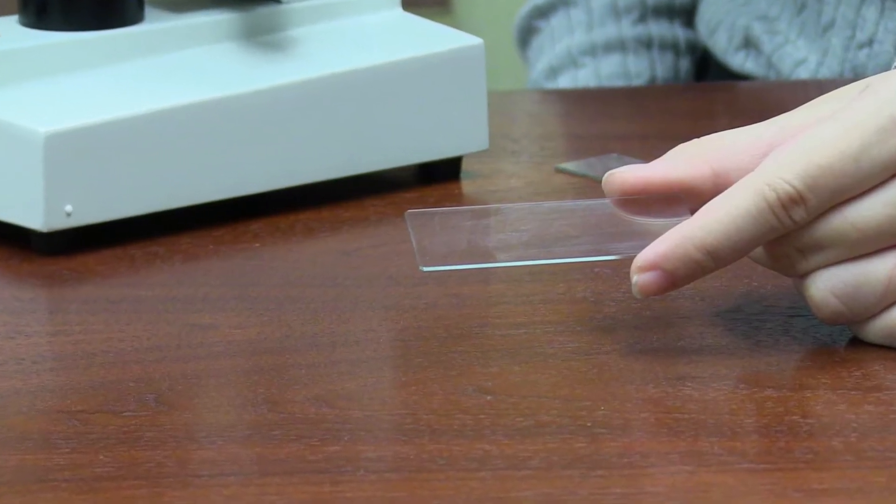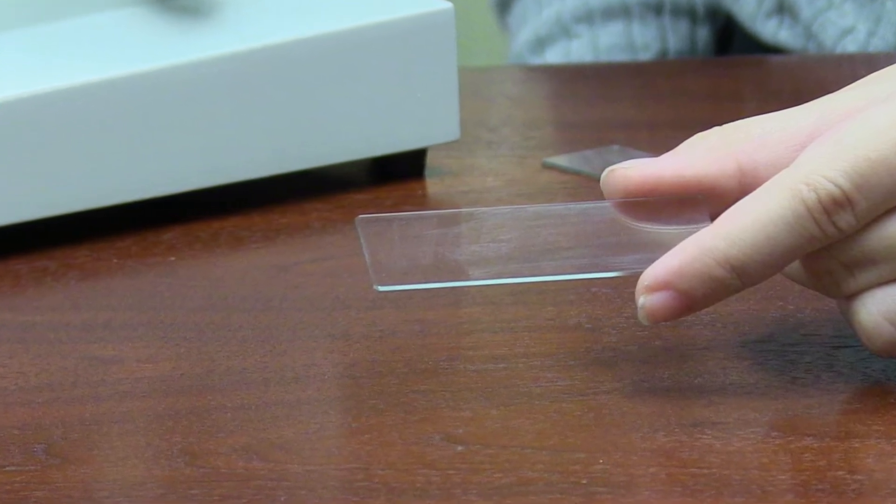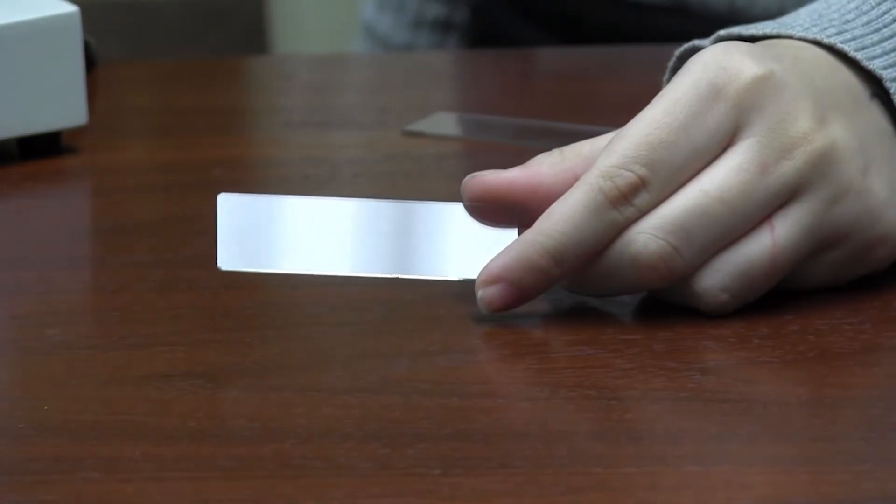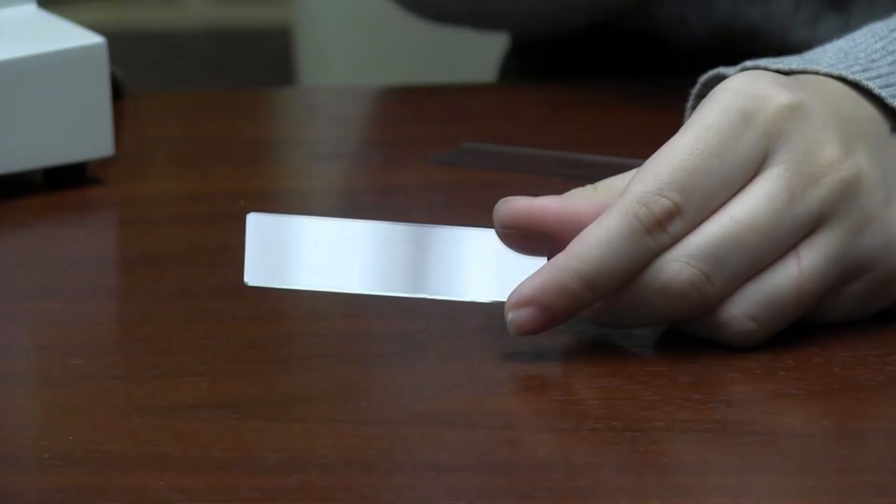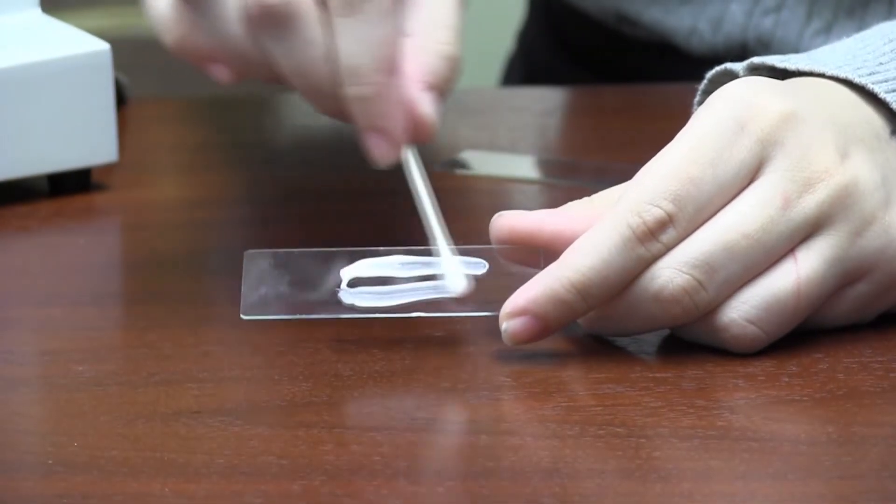To create a slide to view with the microscope, begin with a clean slide and cover slip, or a second slide. Handle this slide by the edges to avoid placing fingerprints on the surface. Use a swab to collect the substance you want to view and wipe it on the slide carefully.